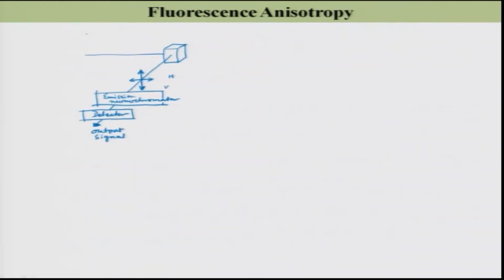I will use horizontally polarized light for the excitation. So, this is H. Okay.